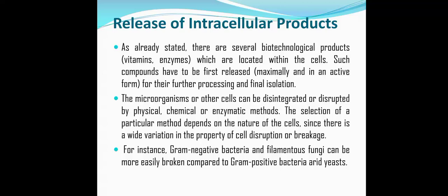In the previous video, we already discussed the first step in the extraction of the extracellular product, that is, cell harvesting. So today we are focusing on the extraction and purification of intracellular product, where the initial step is nothing but the release of the intracellular product.